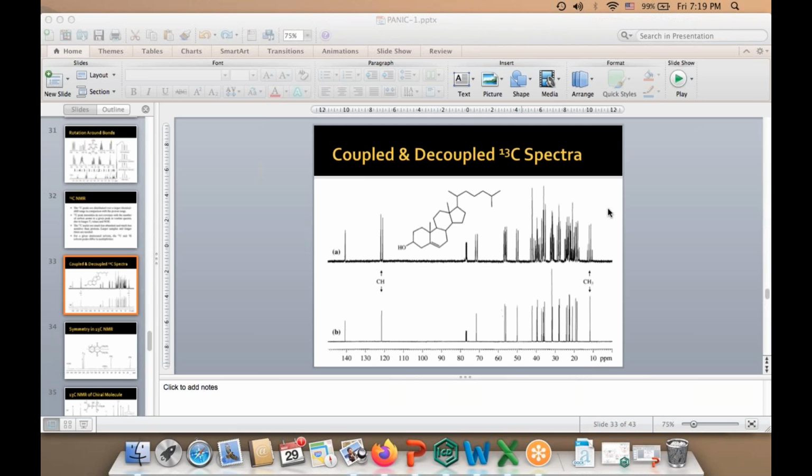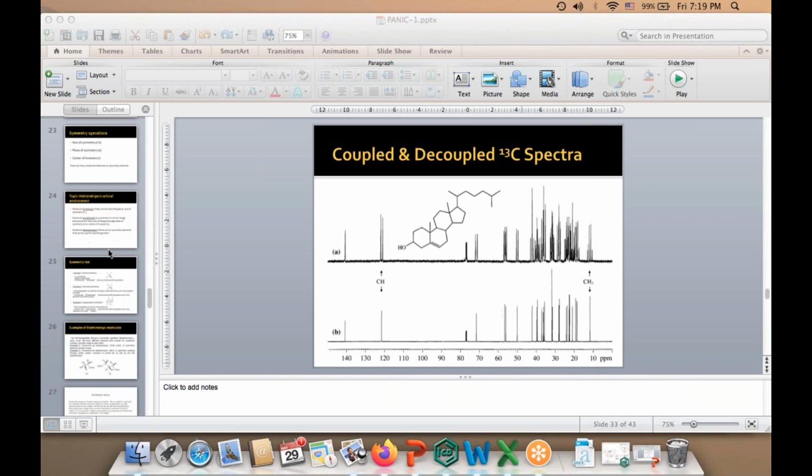Sure. Number one, from Dr. Wajid Jafri: if the molecule is symmetrical, then why is one set of peaks downfield and the other upfield? The thing is that one set of peaks is downfield or upfield just because of the electronegativity in the molecule. Let me go back to the slide.